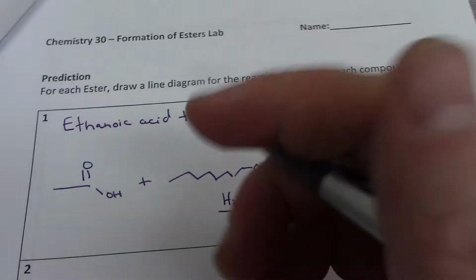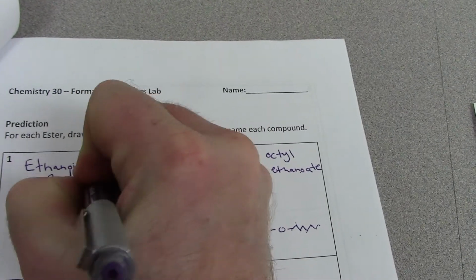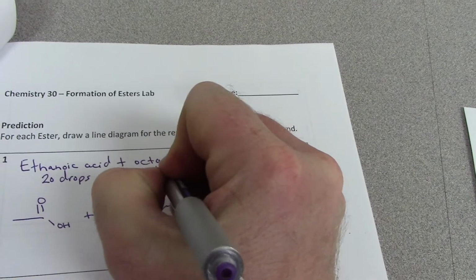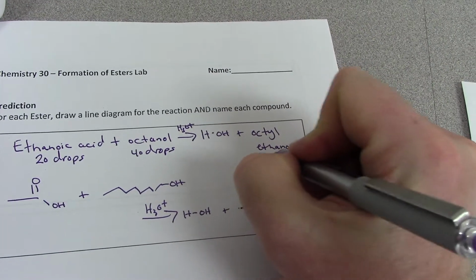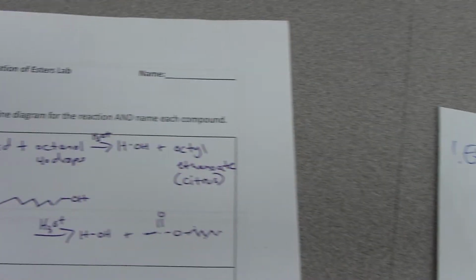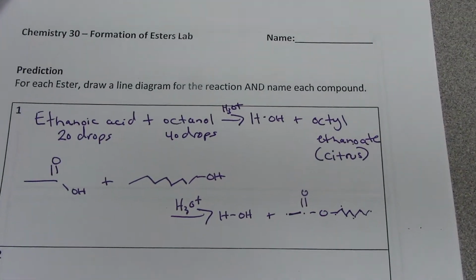All right, and then include this as well. In order for this to happen properly, I need to use 20 drops of this from a dropper bottle and then 40 drops of this. So you're just going to record this. My flavor is going to end up citrusy from that molecule. So you're going to do that for all 8 of them, and that's what you're going to hand in.